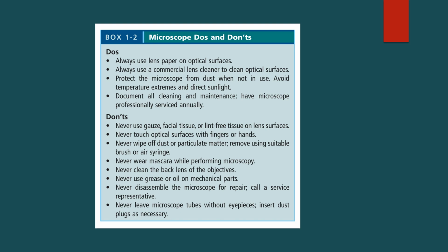Never clean the back lens of the objectives, never use grease or oil on mechanical parts, never disassemble, and never leave microscope tubes without eyepieces. That is for such.